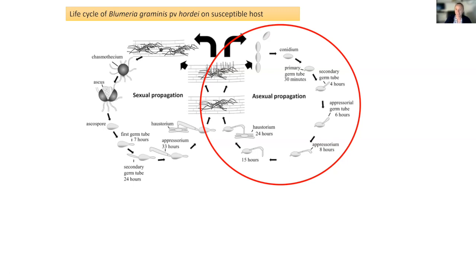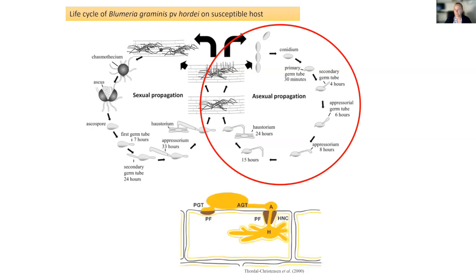What we're interested in is what happens at the cellular level. We study the process of a spore falling on the leaf and the initial stages of interaction between the pathogen and the plant cells. Usually there are several anatomical structures that can be easily distinguished. There is the germinating spore, which has the first germinating tube, the primary tube, and then the secondary hyphae that forms an appressorium, the end of the tube, putting pressure on plant cells and also producing enzymes to modify the plant cell until another hypha can penetrate inside and spread.